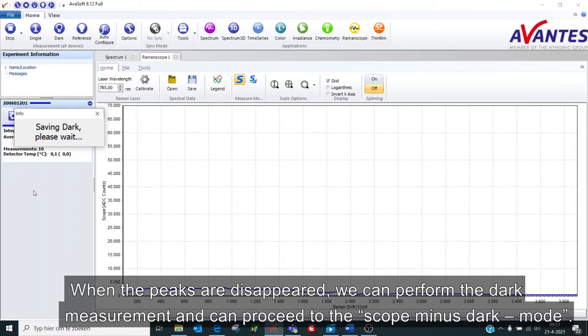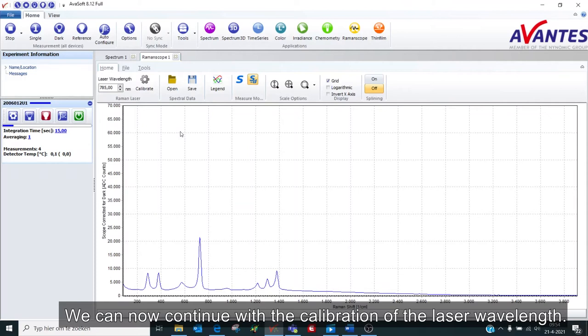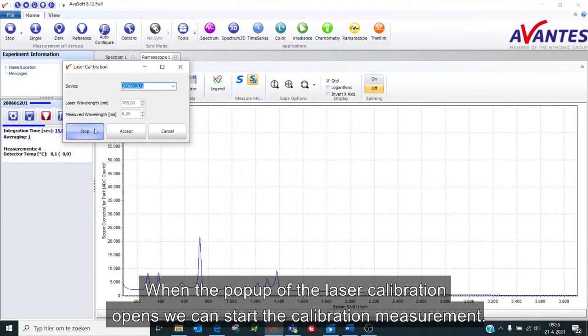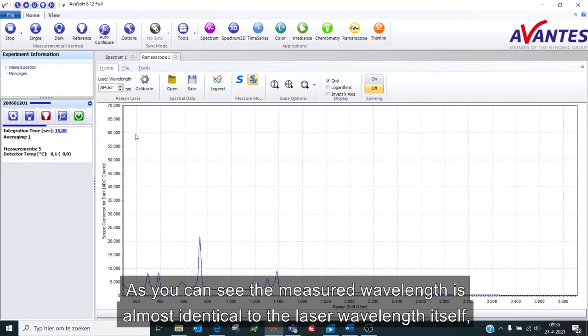After enabling the laser again, we see the Raman signal left. We can now continue with the calibration of the laser wavelength. When the popup of the laser calibration opened, we can start the calibration measurement. It now measures the correct laser wavelength. As you can see, the measured wavelength is almost identical to the laser wavelength itself, and therefore ready to accept and proceed.